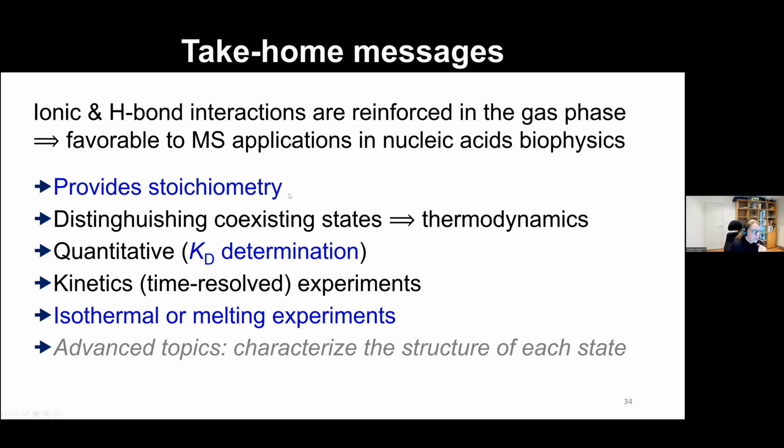And also in our experience, most often than not, we have found unexpected stoichiometries when we did a mass spectrometry assay. So I really encourage you to try it out, to convince your facility, to convince collaborators to try it out when you have complexes where you really want to get to know more about the structure and also what stoichiometries you need to fit your other biophysical assays.